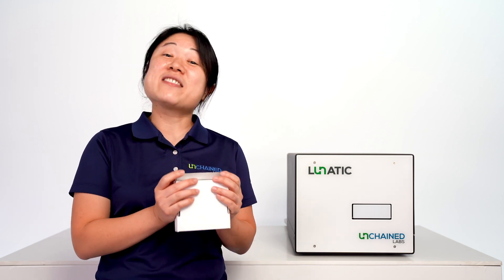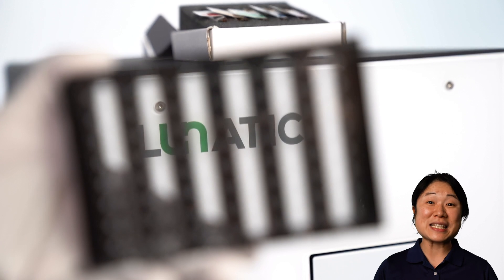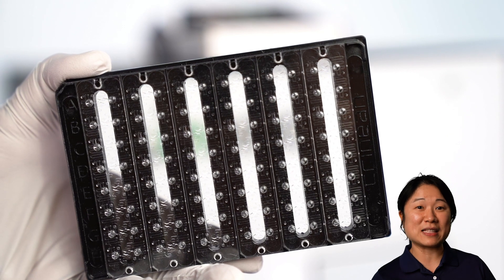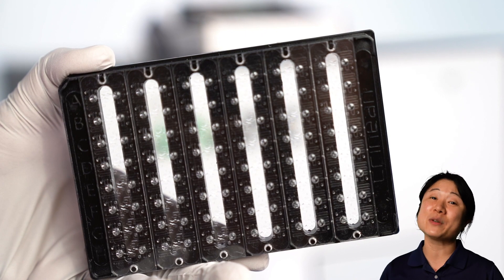Let's dive in and run the Fundamentals. Big Lunatic uses a 96-well SBS format plate. Each microfluidic circuit has two fixed pathlengths built in to cover a wide dynamic range of 0.03 to 275 OD.